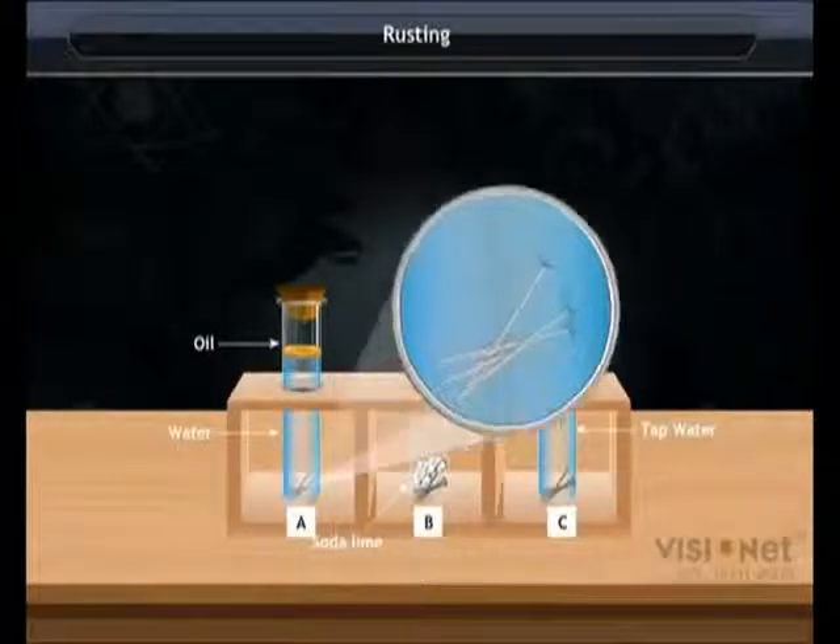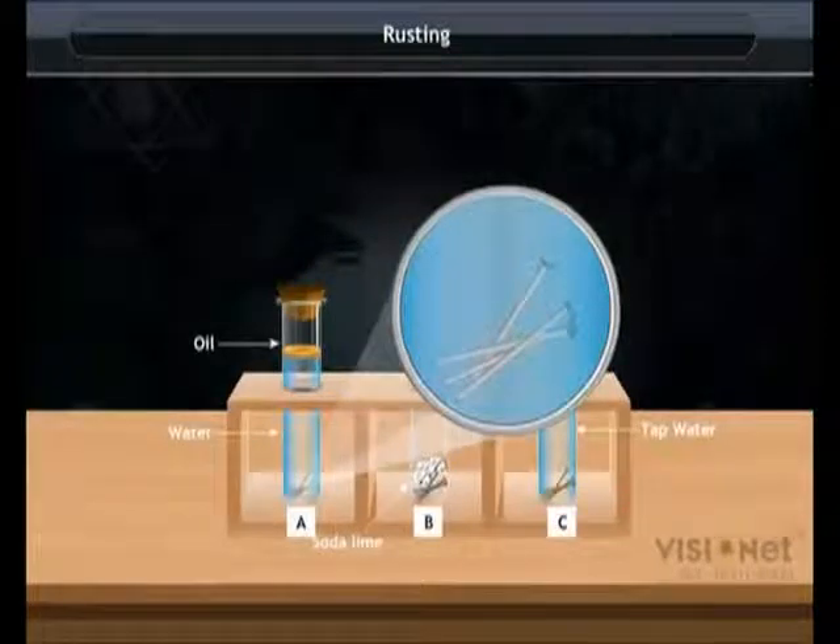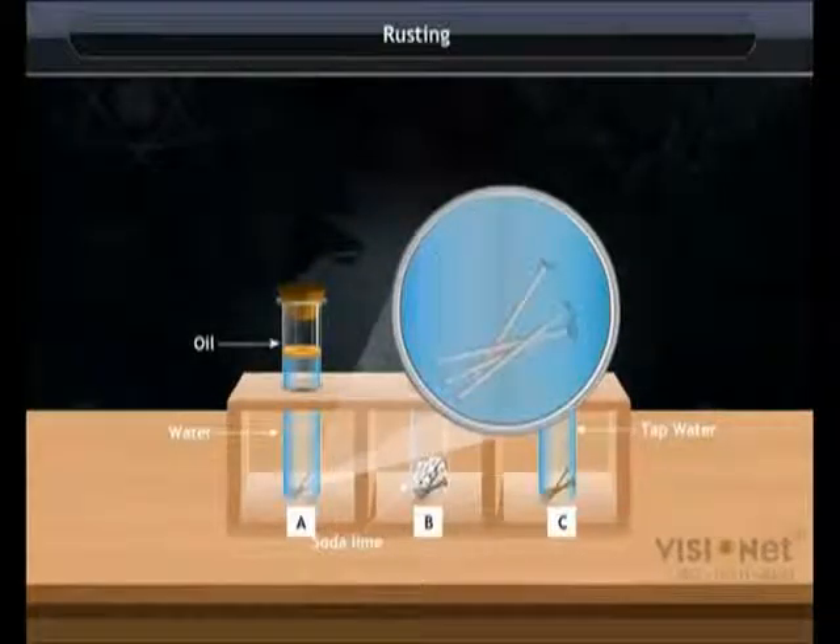In test tube A, the nails do not rust. They have water but no oxygen. Boiled water does not contain any dissolved oxygen, and the thin layer of oil prevents oxygen in air from reaching the water in the test tube.